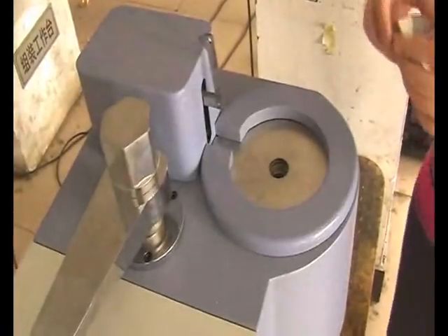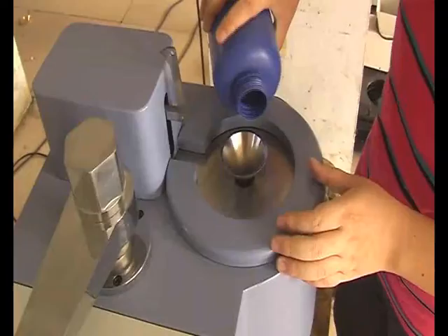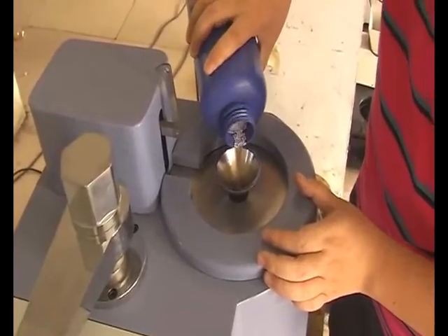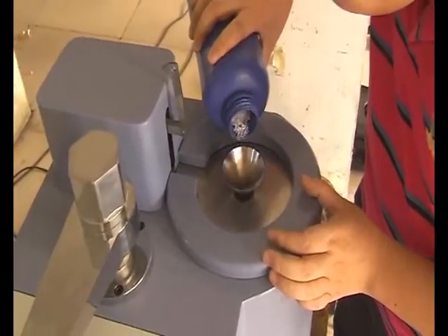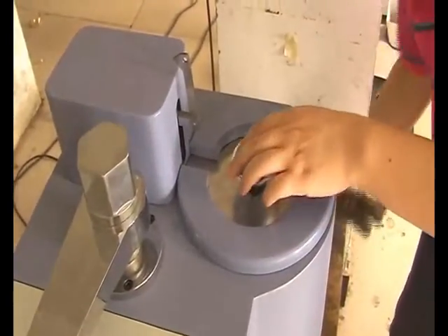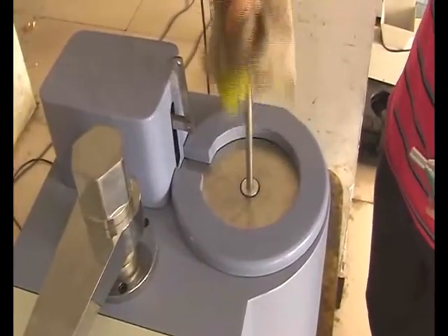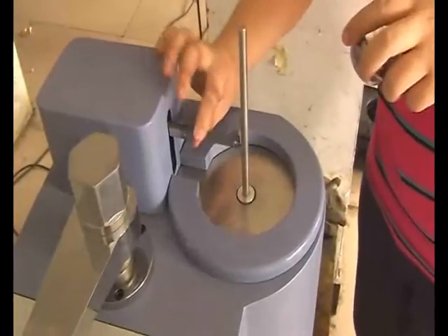First, take the pin vertically, then place the funnel. Second, put the material into it and take away the funnel. Third, put in the piston rod and take the pin back to horizontal. Last, place the test weight. Please pay attention — the whole process of putting in the material must be finished within half a minute.